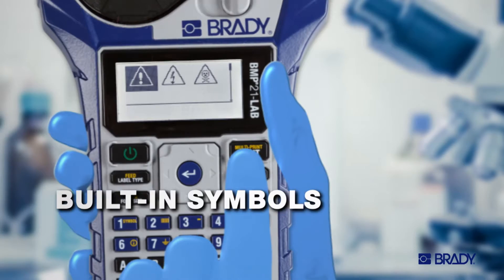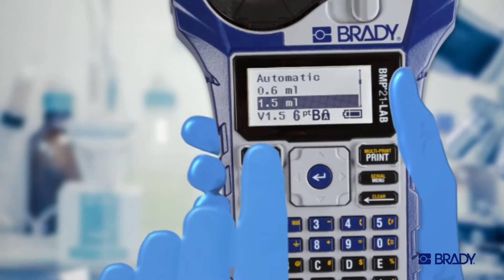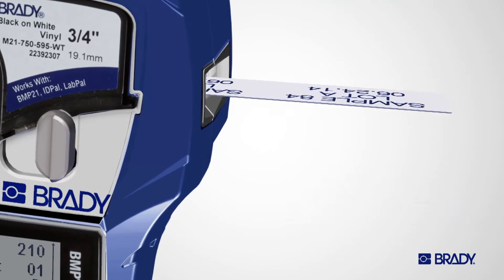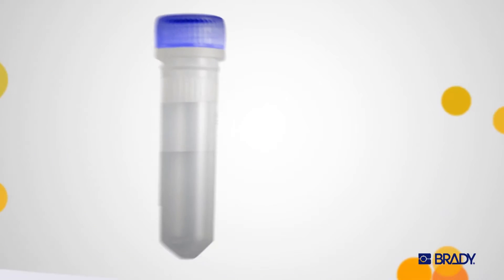With built-in symbols, lab-specific apps, and templates like these for fast, accurate serialization, you'll never lose data, and you'll never use a pen again.